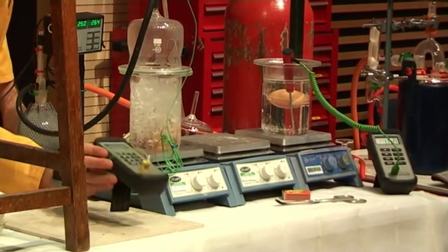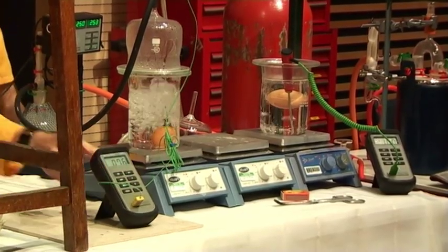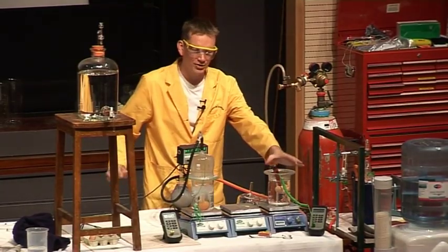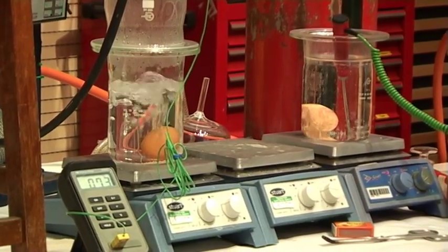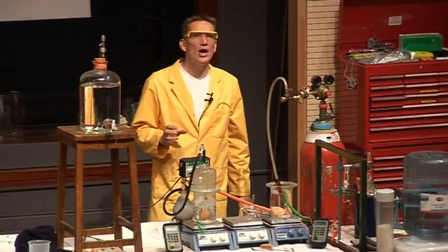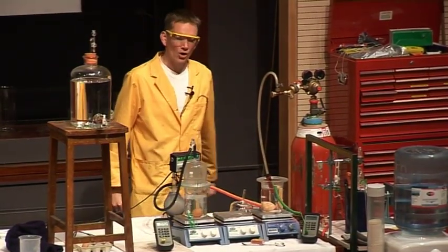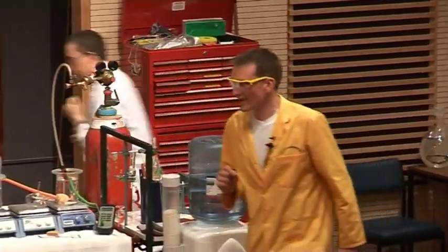Okay, and actually the temperature here has dropped now to 77, 76 degrees C, and it's dropping, but the water is actually boiling. This water is boiling at 100. This water is boiling at, well, it's at 73 degrees C now, but it really is boiling. Now, why on earth is this water boiling at only 70 degrees, whereas normally we know that water boils at 100? Before I answer this one, I need to put the rest of my dinner on. I'm going to have egg and chips.